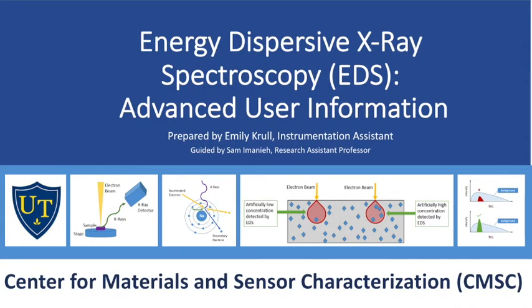Hello, my name is Emily Krull, and I'm from the Center for Materials and Sensor Characterization at the University of Toledo. This video is for EDS users who already know the basics and are looking for more advanced information to push their quality of characterization to the next level.